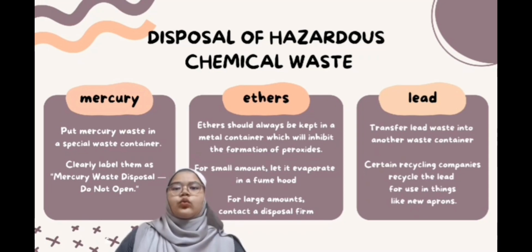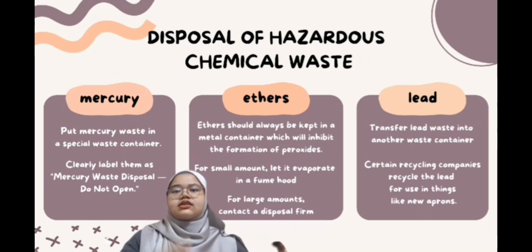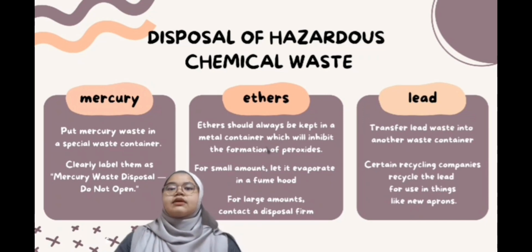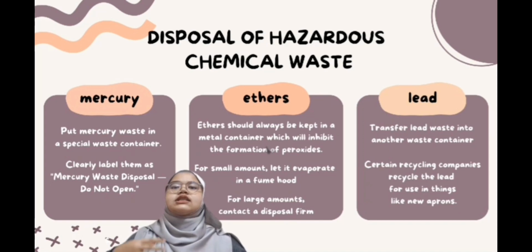Lastly, for lead waste, transfer it to another container and label it with lead waste disposal. In this case, lab assistants can directly deal with certain recycling companies as they need lead-based products and recycle the lead for use in things like new aprons. But make sure to have a look for a licensed hazardous waste carrier to handle lead waste properly.